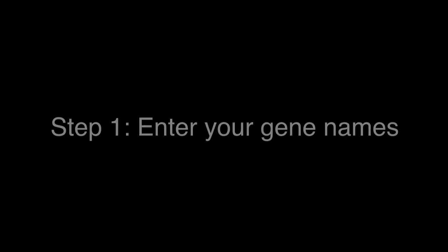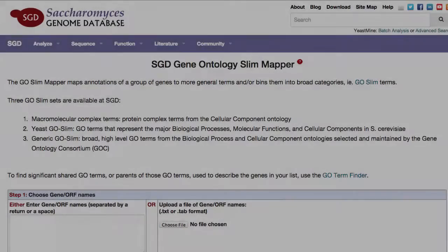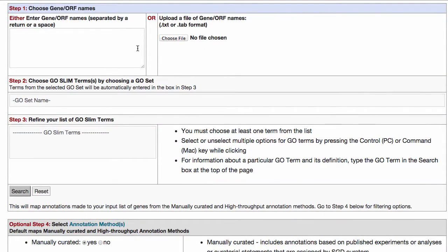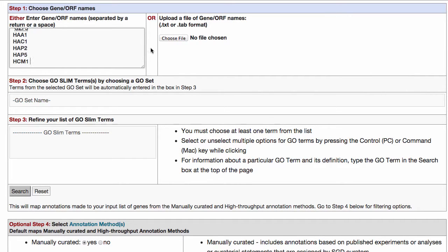Step 1: Enter your gene names. To get started using the GoSlim Mapper, enter your gene names of interest in Step 1, separated by a return or space. Or if you have your genes already saved in a text file, you can upload that file instead. Note that it needs to be in a .txt or .tab format.